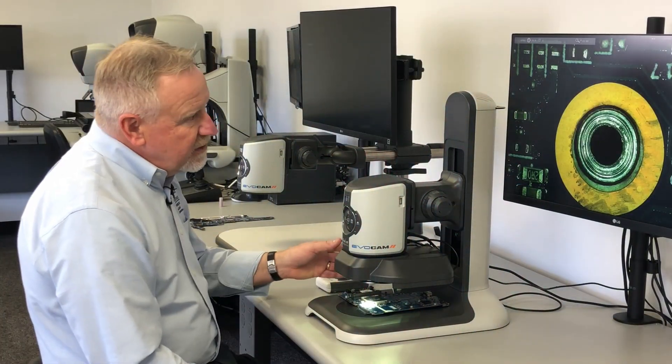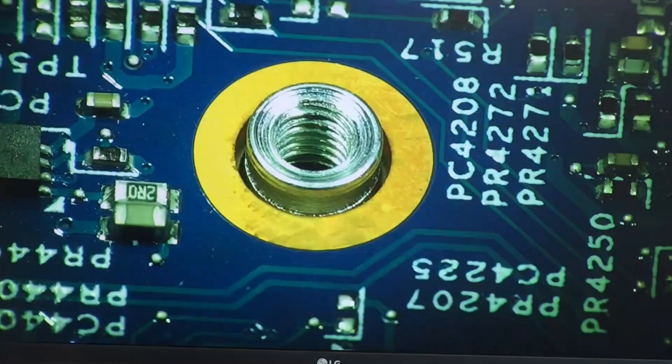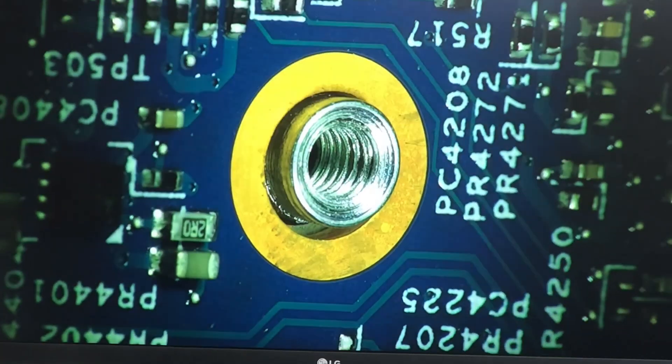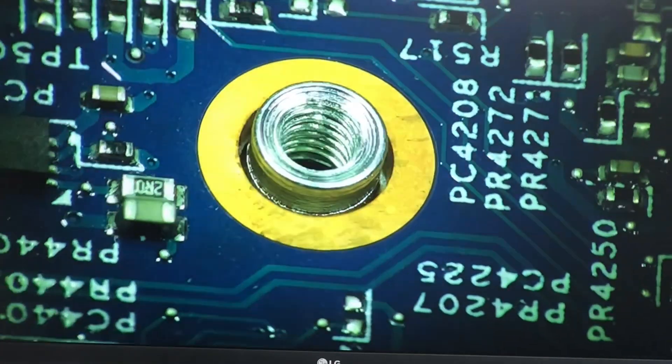Here we're looking at a mechanical fastener. Looking straight down we really can't tell much about it, but if we bring the oblique in, now we can see it really is a threaded insert. We can walk all the way around that to check for damage, defects, or galling in the threads.